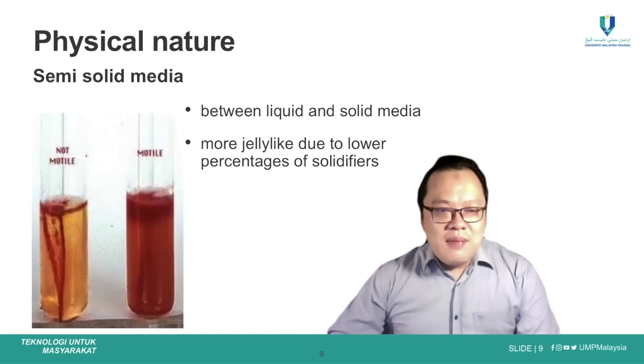Usually it may contain about 0.4% or 0.5%, whereas for solid agar media, the percentage of agar added is between 1% to 1.5%.